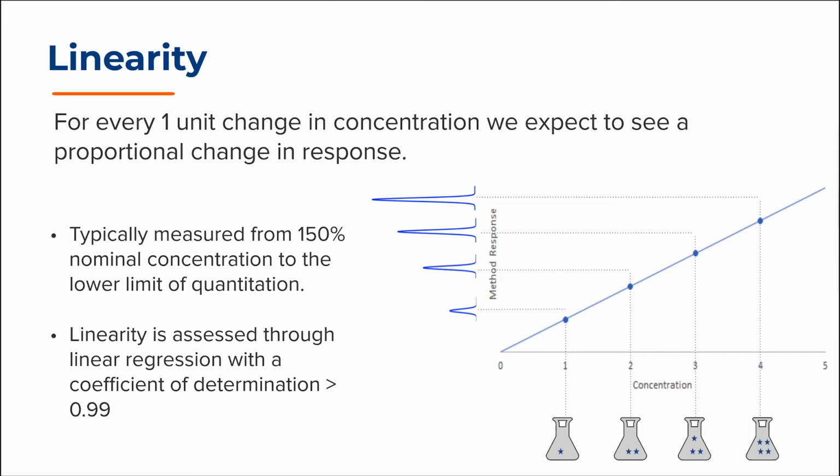That said, R squared is not a perfect assessment of the quality of the linear fit. However, it is the only requirement spelled out in ICH-Q2. We recommend additional data analysis be performed to ensure that there is no bias introduced by the fitting procedure. For example, assessing the residuals of the regression line will highlight potential biases or shortcomings of the linear fit. Often the residuals show quadratic curvature if a bias or additional quadratic terms are missing in the linear regression model. The magnitude of these residuals will provide a gauge on how strong these biases are influencing the linear regression.